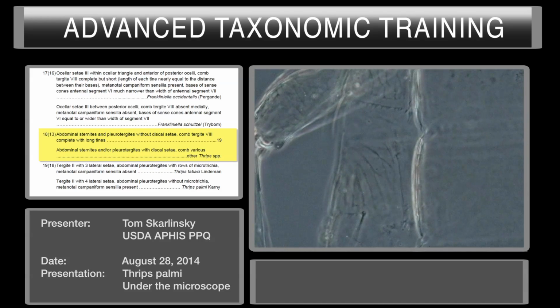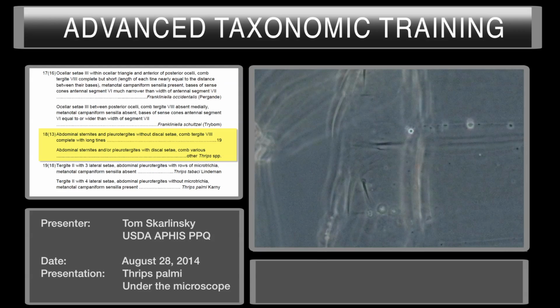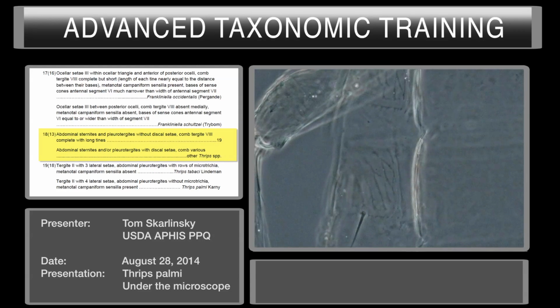And what happens is, because this is actually a three-dimensional insect, and we've kind of squashed it down, that pleural tergite, which normally in nature, those lines of sculpture are going to roll in the same direction. In other words, in nature, in a full specimen, it's going to go this way and down and around, but when you squash this pleural tergite down, they change direction.